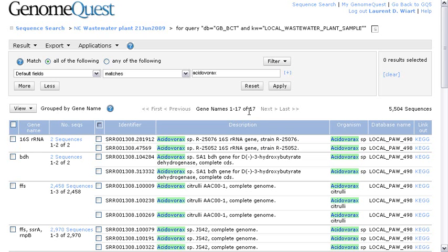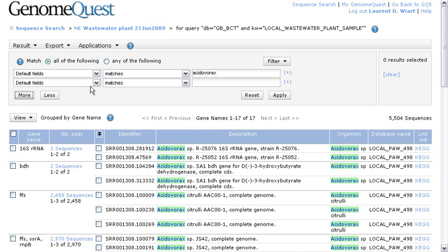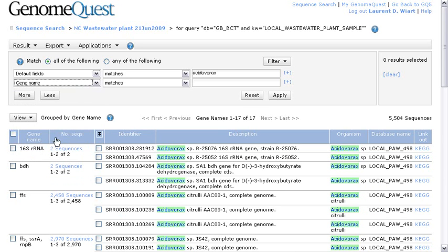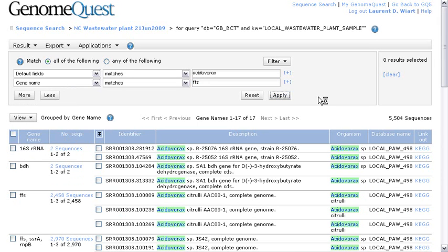So now, on this page, we can see that we have a total of 17 different genes represented in this set. And we could refine even farther and ask for gene name being, for example, FFS and apply this new filter.